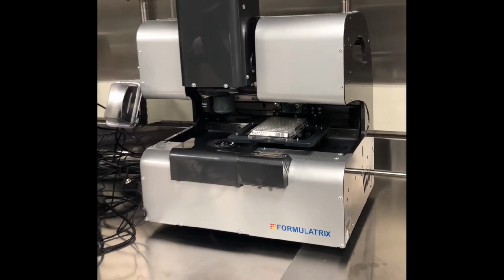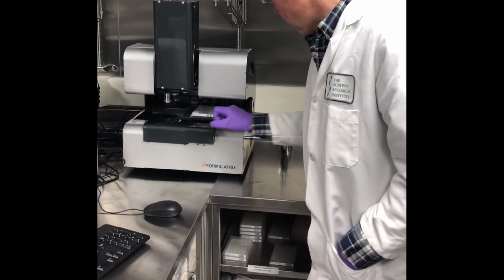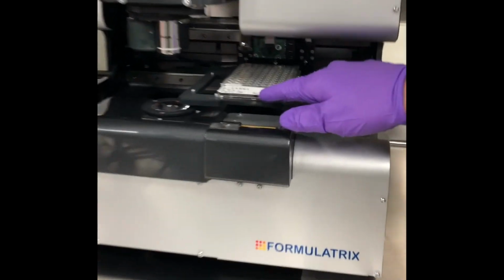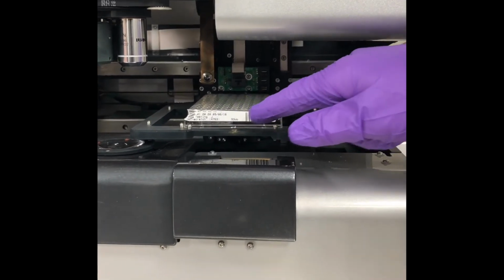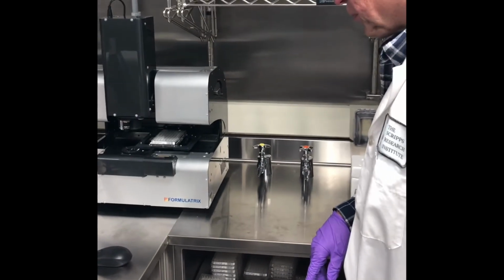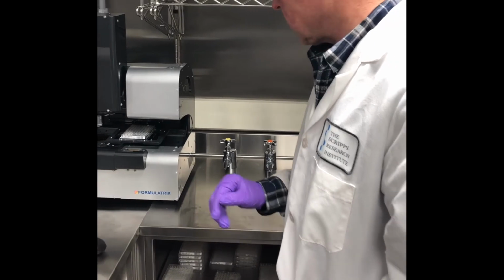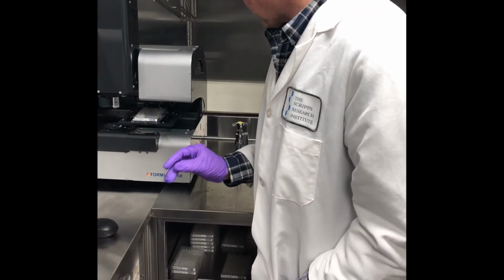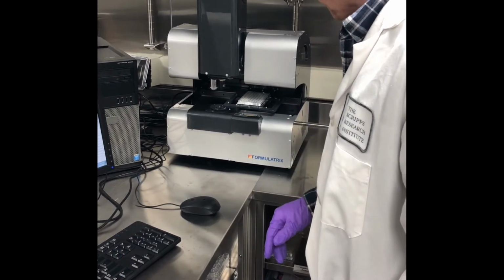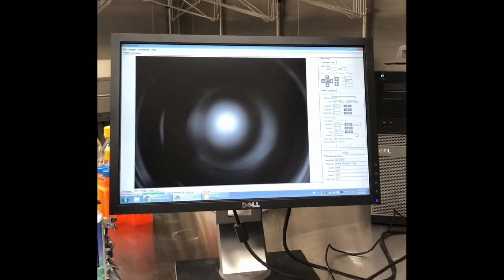Now, if the barcode reader fails, it's going to prompt you to enter the barcode number. That's that alphanumeric code here. So in this case, it's 930B. That's different than the plate number. It represents the barcode. So it may ask you for that. The barcode reader might fail, usually due to condensation or if the glue is not good on there because of the cold room.